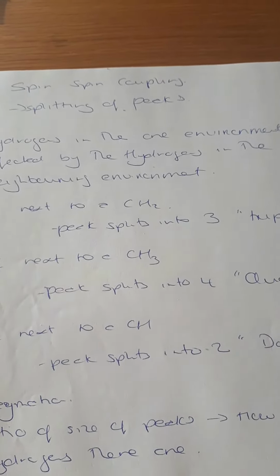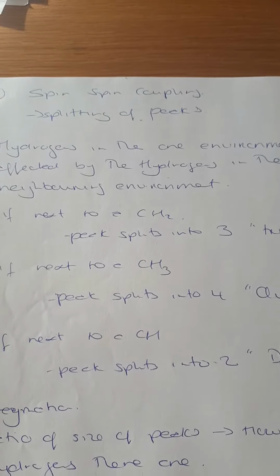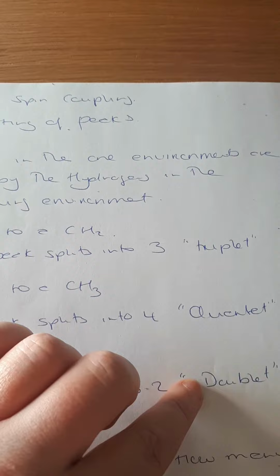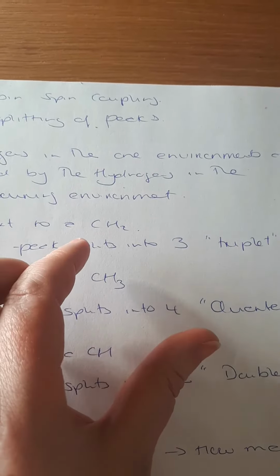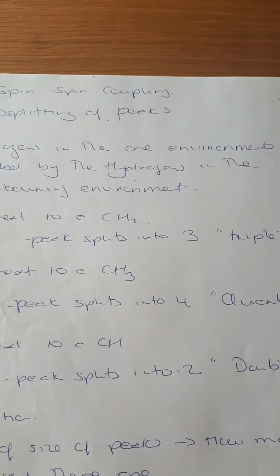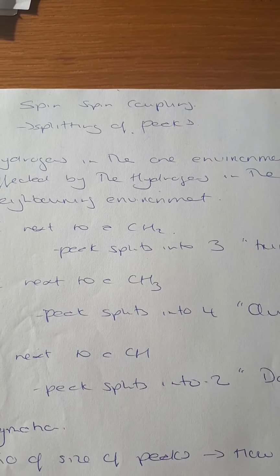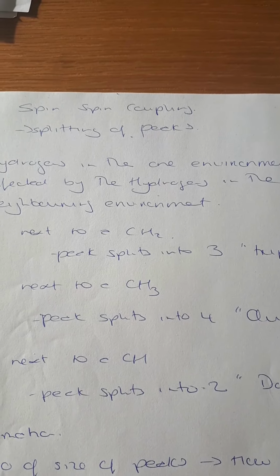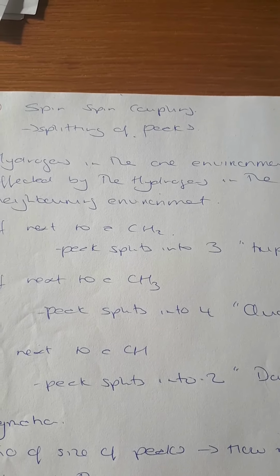And that's what we see a lot in our unknown spectra. Now sometimes these can look very squashed, and you'll see in our unknown spectra they maximize it, they hone in on them, and they make it clearer to see. But that's how we can tell which environment is directly attached to the next environment. And that's why NMR spectroscopy is so good at identifying molecular structures.